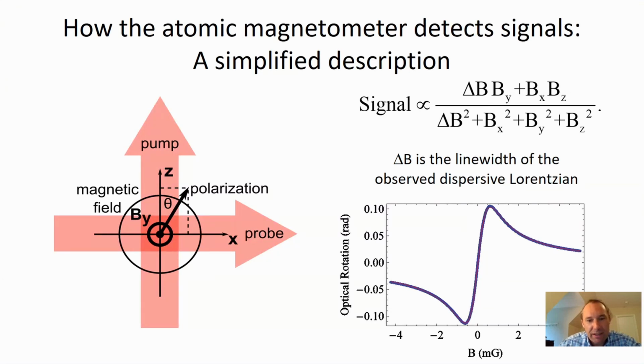The big problem with that is that if you now want to measure frequencies that are outside of that range, and maybe magnetic fields that get too large, then things break down. And therefore, it is kind of important to have a balance here where you set up your system in a way that your delta B is optimal for doing ZULF-NMR measurements, measuring magnetic fields in the right range, and also being able to detect all the different frequency components that you do want to detect.